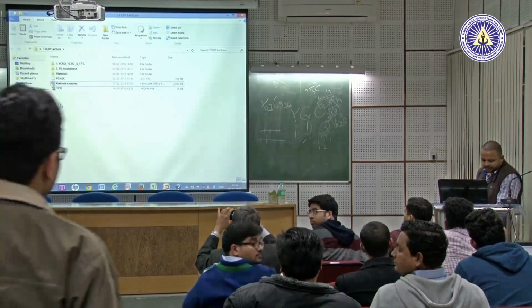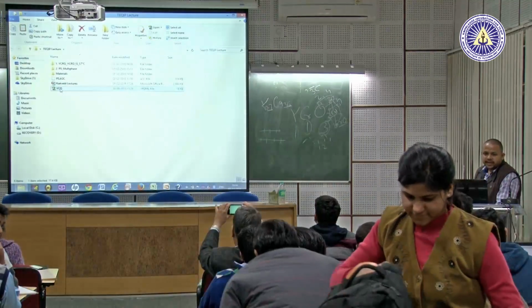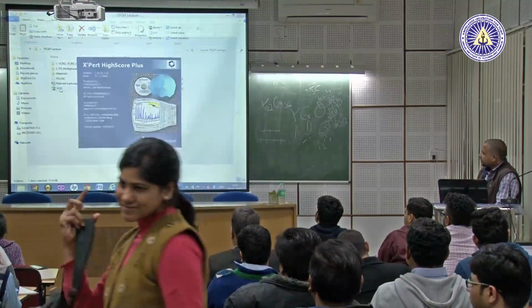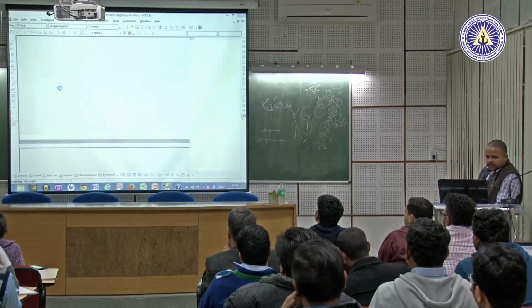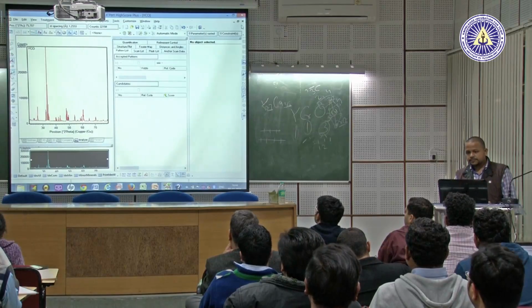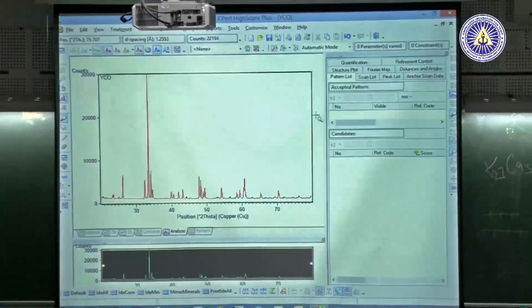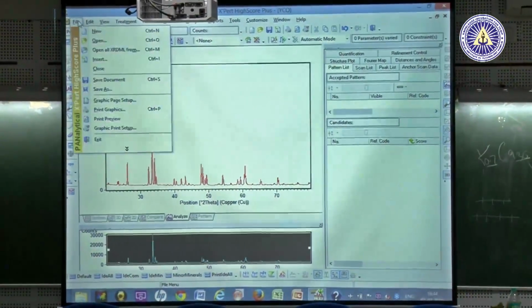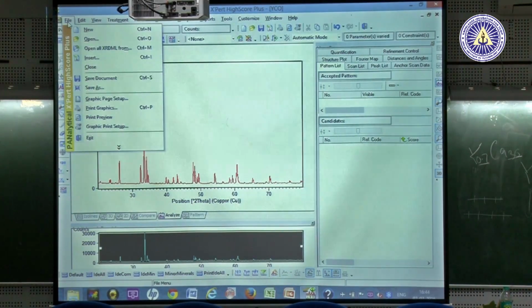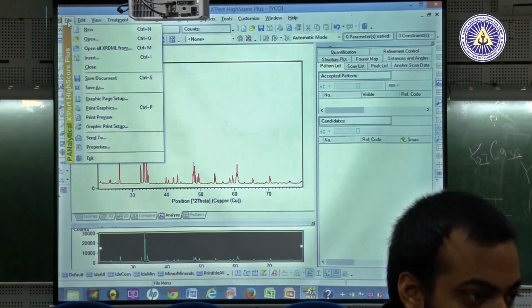Suppose I start from the exact beginning. You have XRD data. One software is X'Pert HighScore. Just click, go to the file, then the option open, and put your XRD data here.